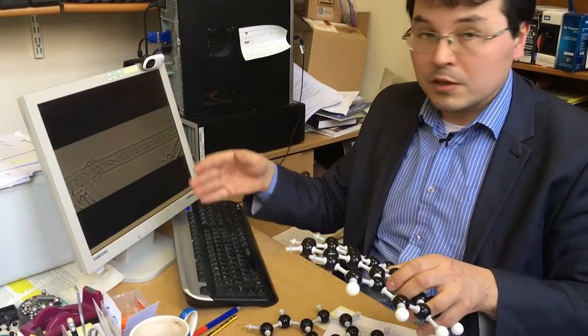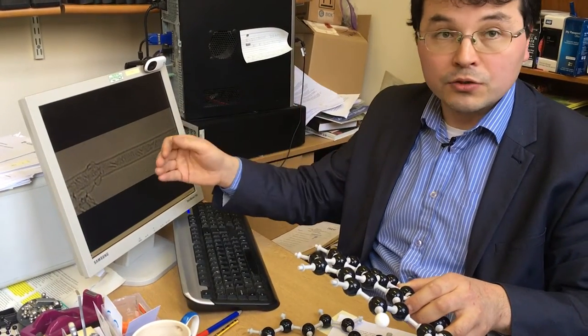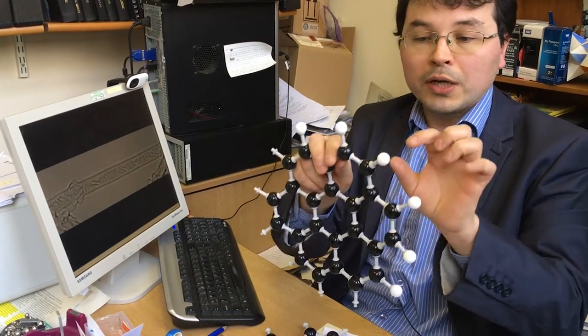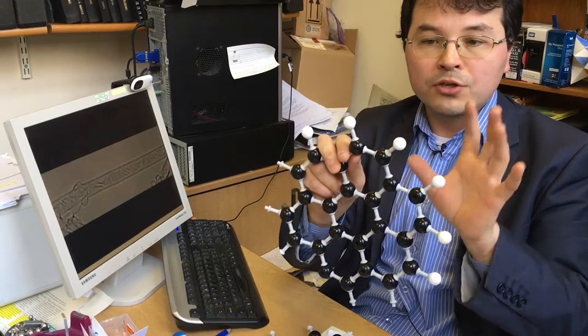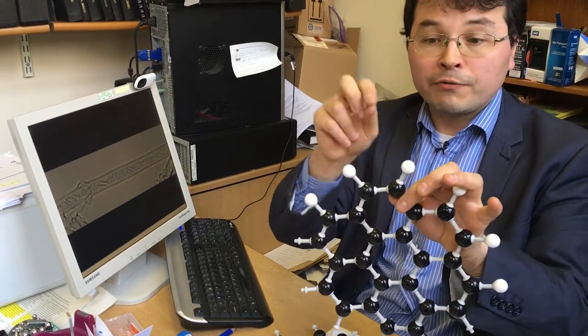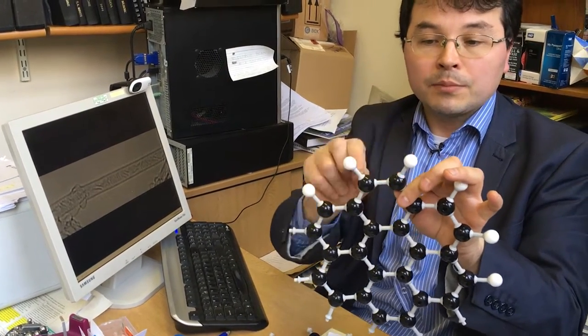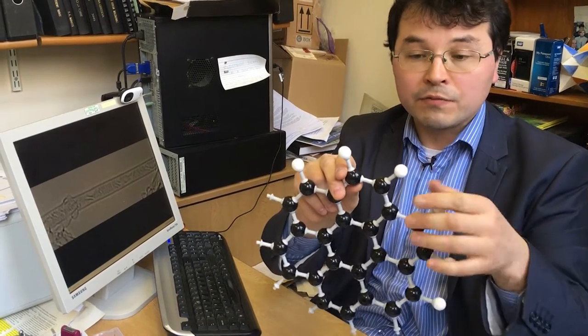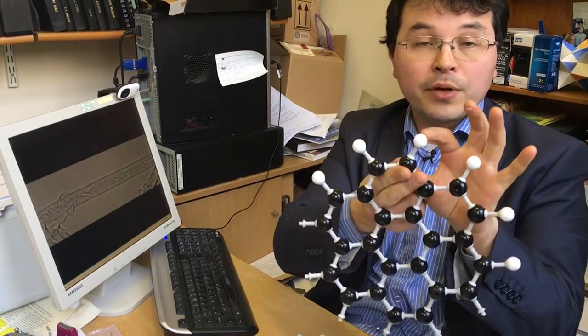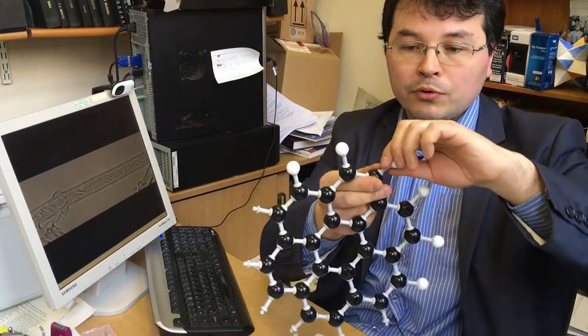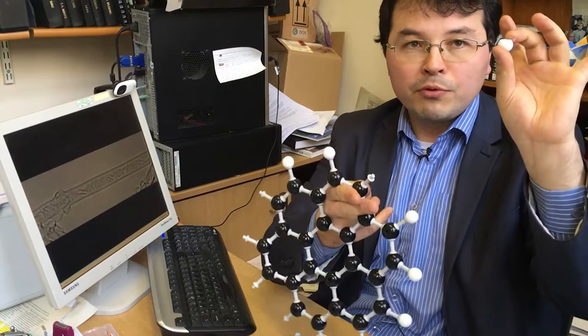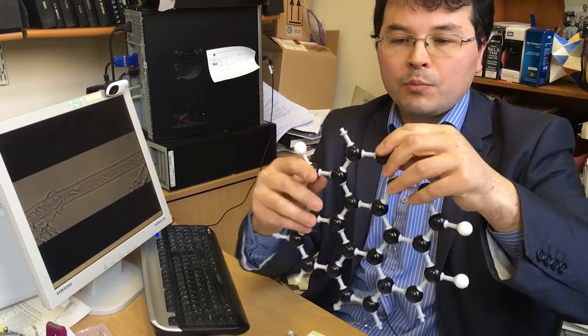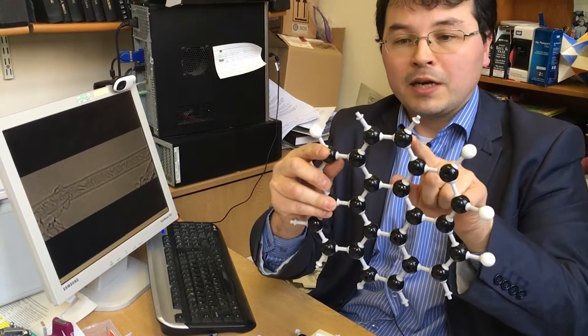As we take this movie, obviously we shine an electron beam through the nanotube that hits the molecules. As this electron beam hits the molecule, we can break the chemical bonds. You can imagine that a fast electron of the electron beam collides with atoms of carbon and chlorine. And as they do so, provided that the energy of this collision is sufficiently energetic, we can break chemical bonds on the edge of this molecule. So what I'm doing, I'm removing the chlorine atom. One is gone. The second one is gone. And we ended up with two very reactive carbon atoms now.